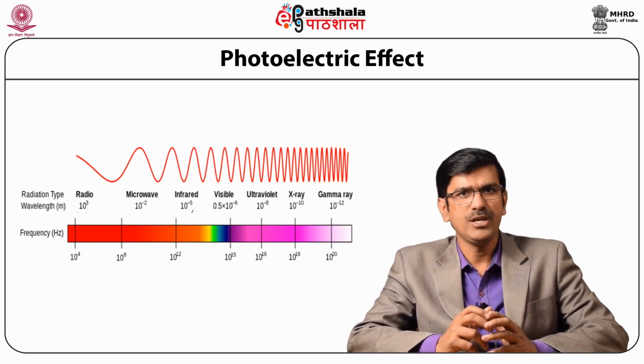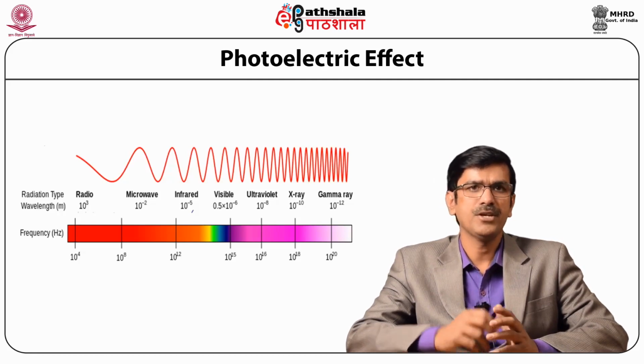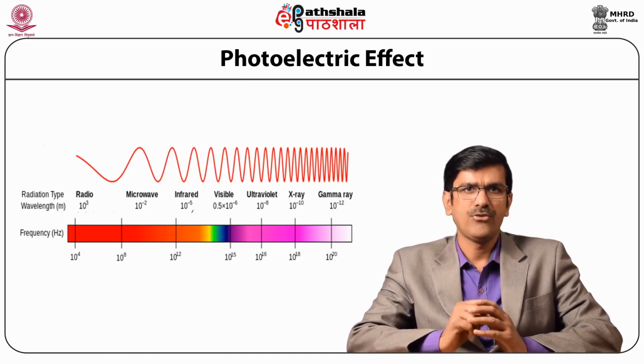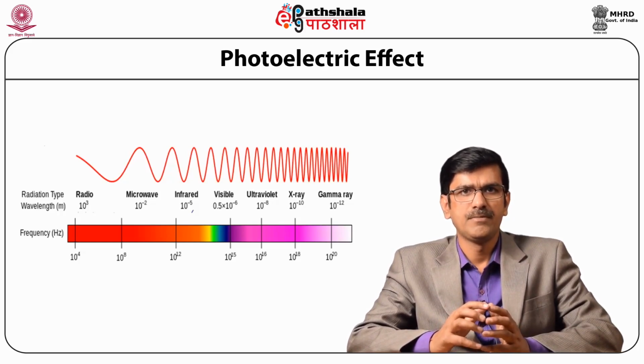Photon energy is solely a function of the photon's wavelength. Other factors, such as the intensity of the radiation, do not affect a photon's energy. In other words, two photons of light with the same color, and therefore the same wavelength, will have the same photon energy, even if one was emitted from a wax candle and the other from the sun.